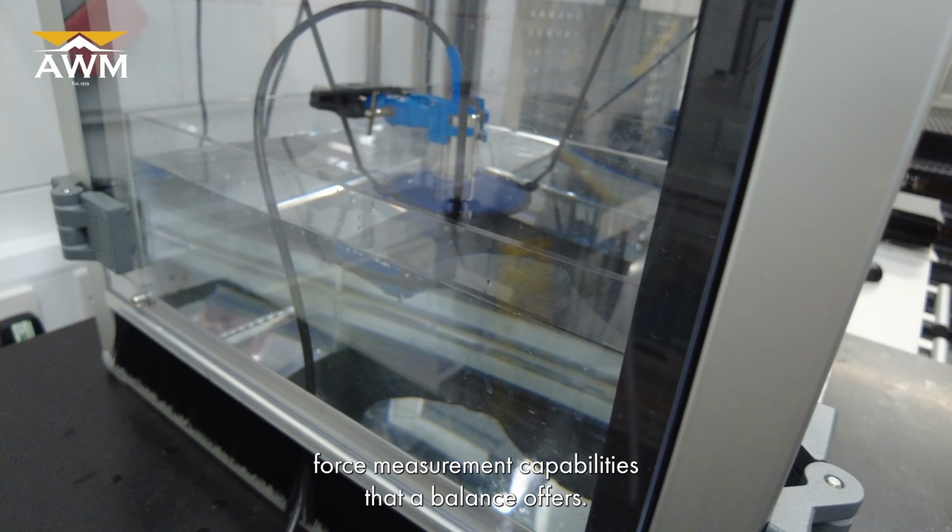So we're going backwards and saying, rather than looking at a mass readout, what we're interested in is the apparent force readout. And from force, we can go directly back to ultrasonic power and create a turnkey service. The balance comes out the box and we can start to install it in the rest of the apparatus that we need.